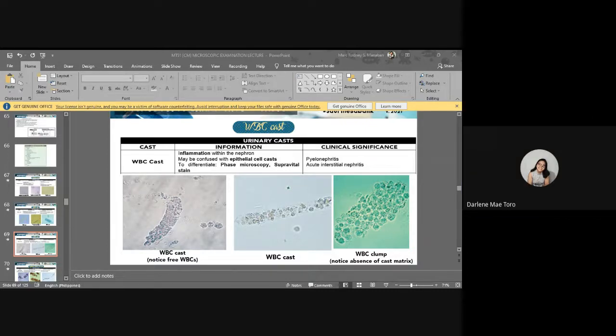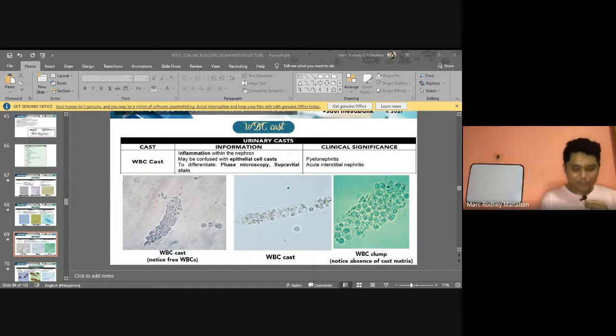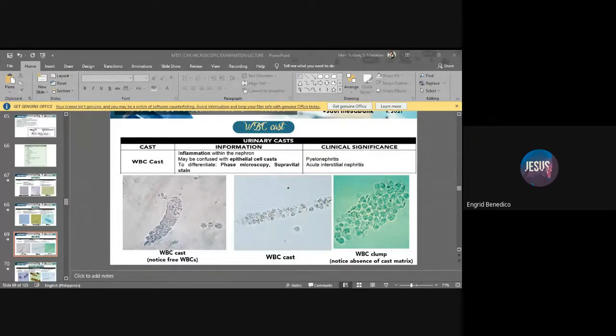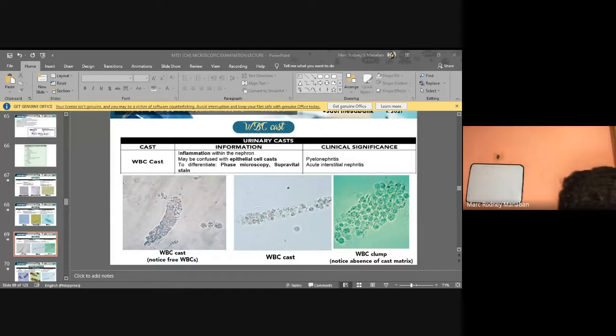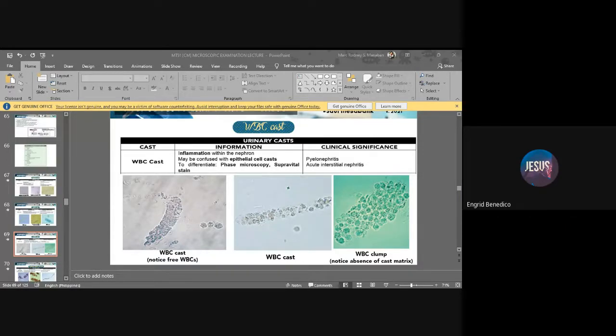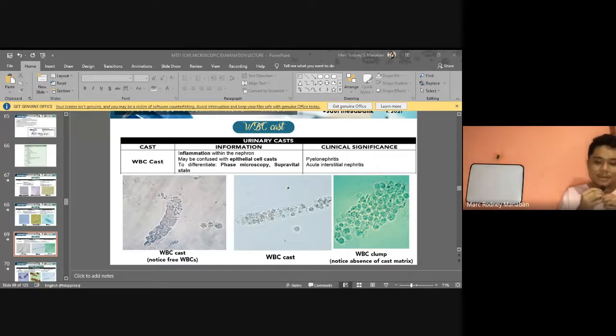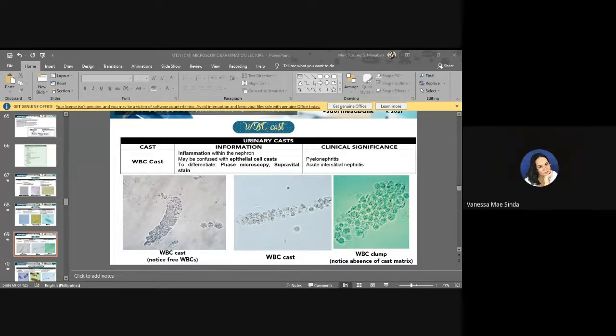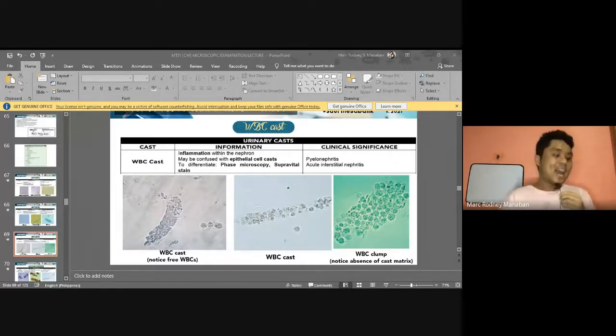PMNs, sir? Yes, polymorpho. Okay, do you agree? Ingrid, what is the answer? Not PMNs, sir, I'll answer. Eosinophils? Okay, eosinophils, correct. Vanessa, do you agree? Yes, sir, I agree. Eosinophil. All right, and that is correct.